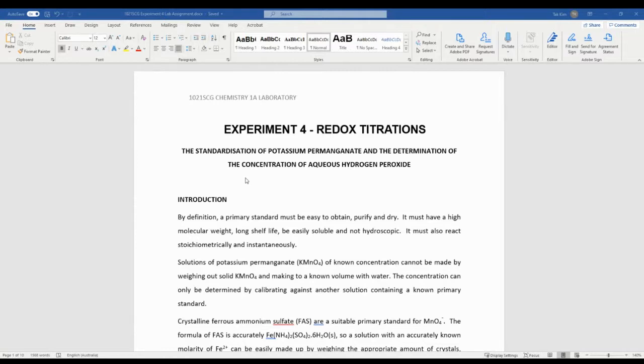Assuming you are doing your experiment, once you get into your lab, you will see 2 separate stock bottles, and they have labels with the names and another thing called concentration.